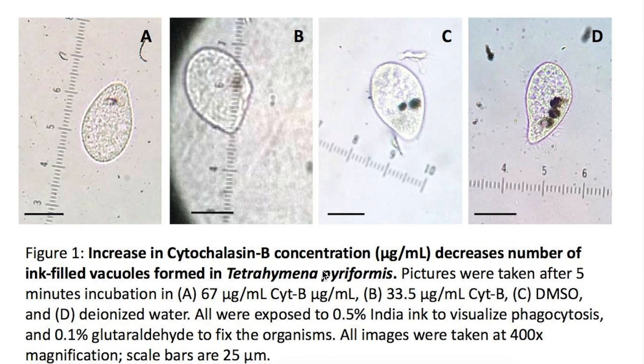Here we have Tetrahymena piriformis, which is about 50 microns from one end to the other. To measure and to confirm this, we simply take a picture of it like this, and we need to be aware of the size of one of these bars from five to six.